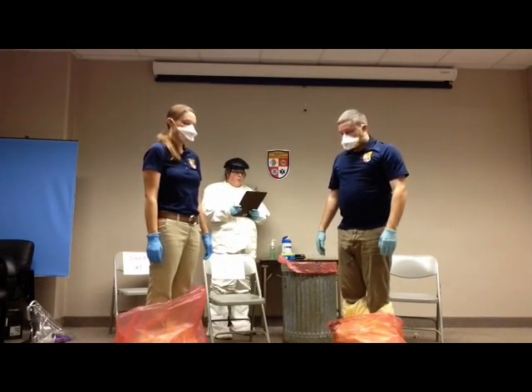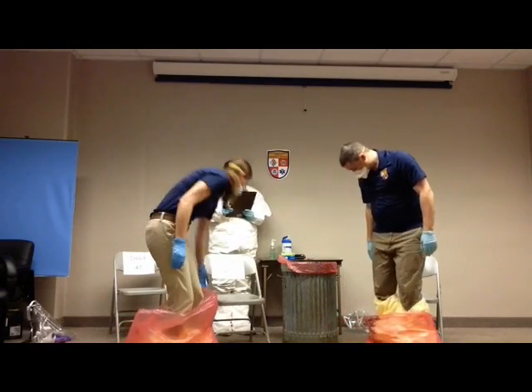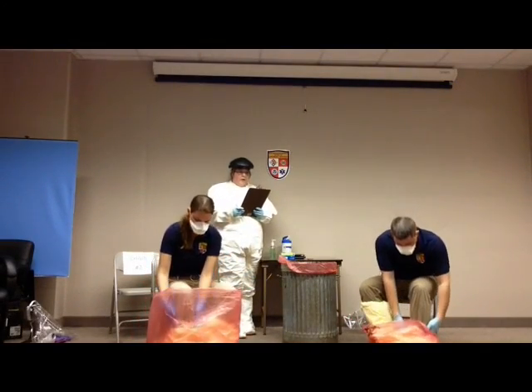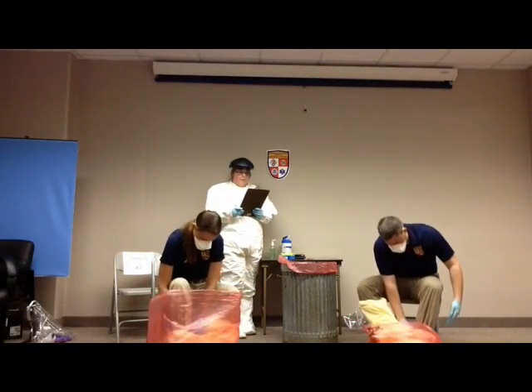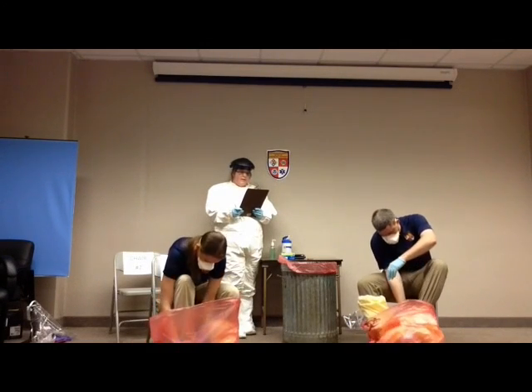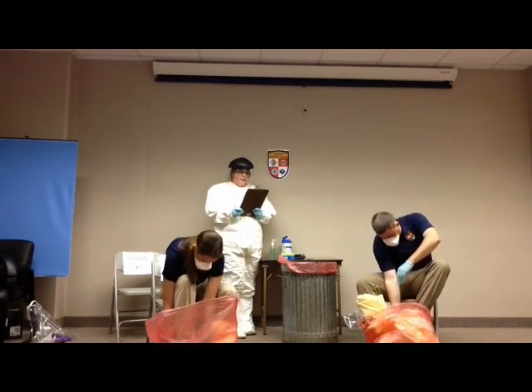Sit in chair 1 and remove 1 foot from coverall, being careful to avoid contact with outside of the suit. Step foot outside of the red bag. Repeat for second foot. Boot covers are removed with the suit. Ties can easily be broken by pushing them from the inside of the suit.